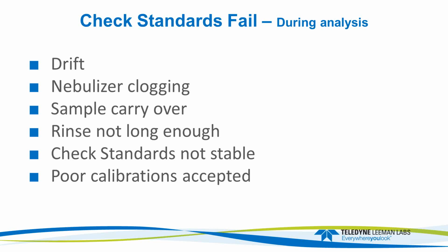Okay. Check standards are not stable, and I've had this happen where just chemically there's a problem, and it doesn't happen right away, but in a long run, it can happen. I had a situation where you put a couple of standards together, and I had amongst a whole bunch of elements lead and barium, and without thinking, I needed sulfur, so I added sulfur, and then as the run progressed, the barium and the lead precipitated out, and I started getting check standard failure. So look at standard compatibility, see what kind of elements you have in there.